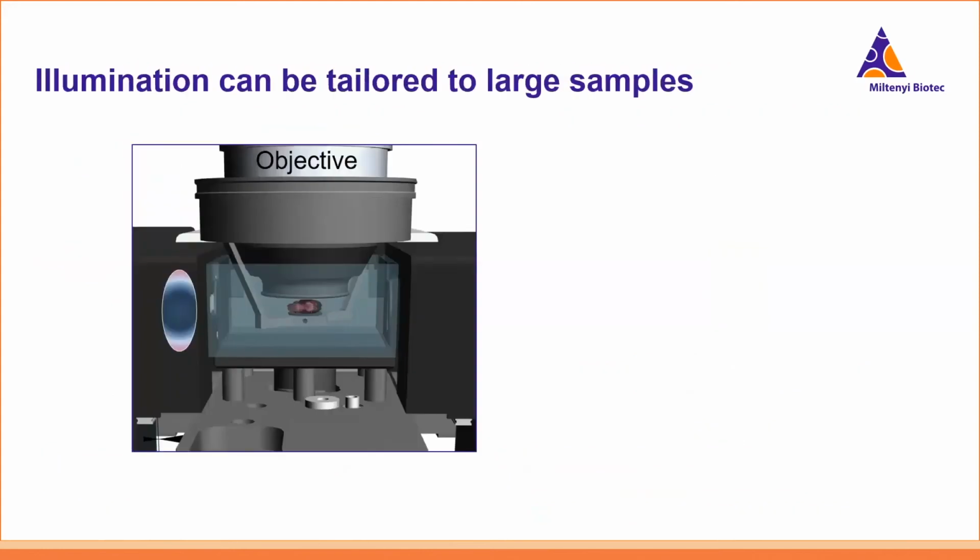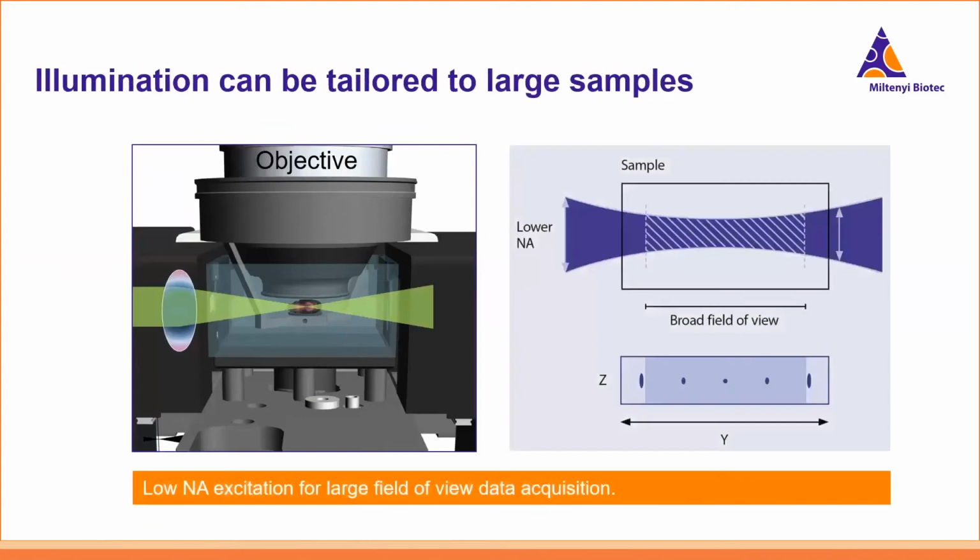Here you see a cylindrical lens on the left that is used to generate a light sheet that will be used to excite your sample from the side. This light sheet, as everything else, is not perfect. Therefore, as the generated light sheet diverges, it approximates a plane only over a given horizontal range called the Rayleigh length. This is the shaded area that you see on the right. This is where the light sheet is thinnest and where fluorescence detection will take place.